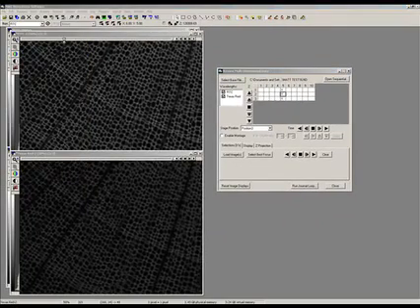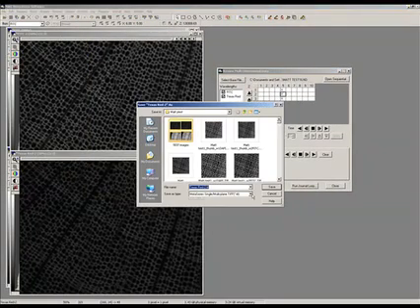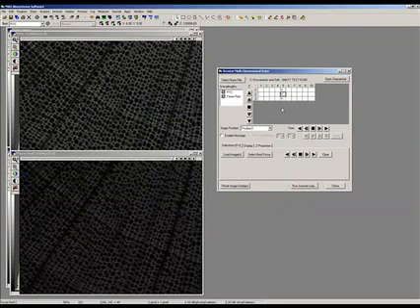then save as and save it out as a stack or an AVI or whatever else my options are at the moment, or a series of TIFFs. So that's really how we would review and get through this data. If I want to open another experiment, I would just go back to select base file and we'd go back in through there.